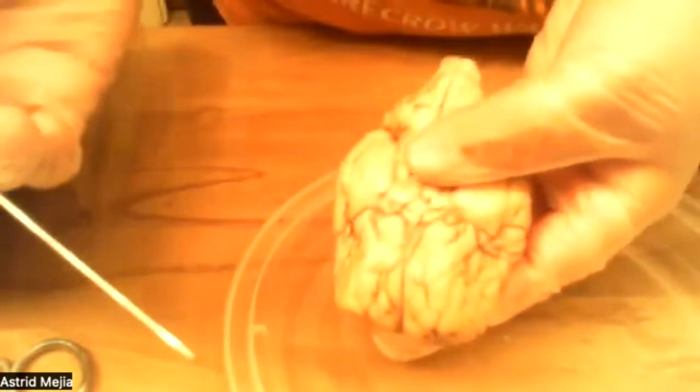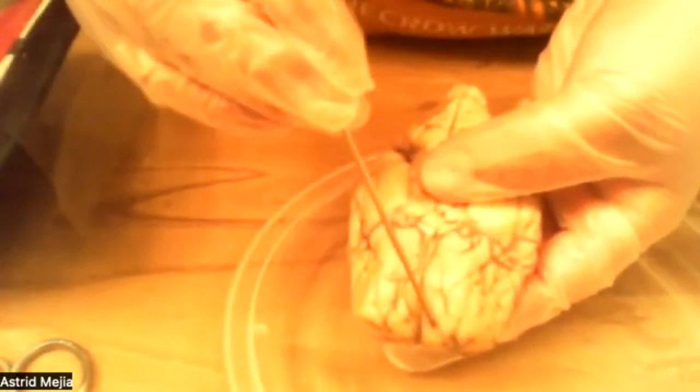For the ventral view is where we're going to see the olfactory bulbs, which is basically going to be this, and right here, these are the olfactory bulbs.